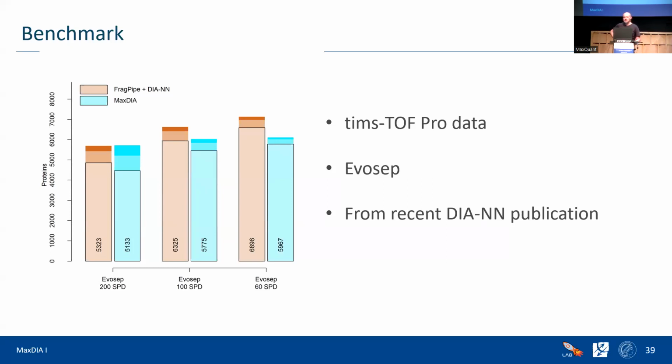A very last question. I remember the MaxDIA was taking all the threads of the PC when we were using it. We put the thread setting as 4, but it was using all the cores. Is this problem solved?